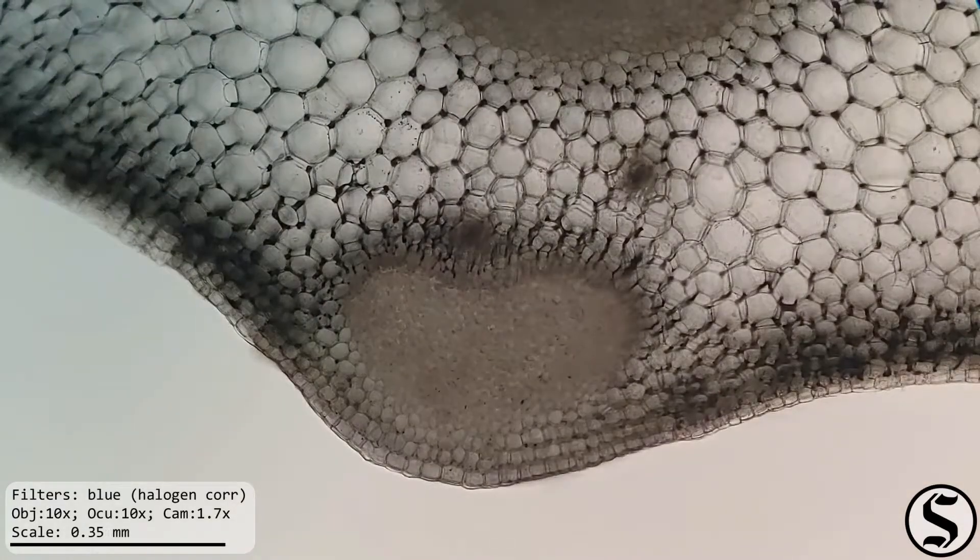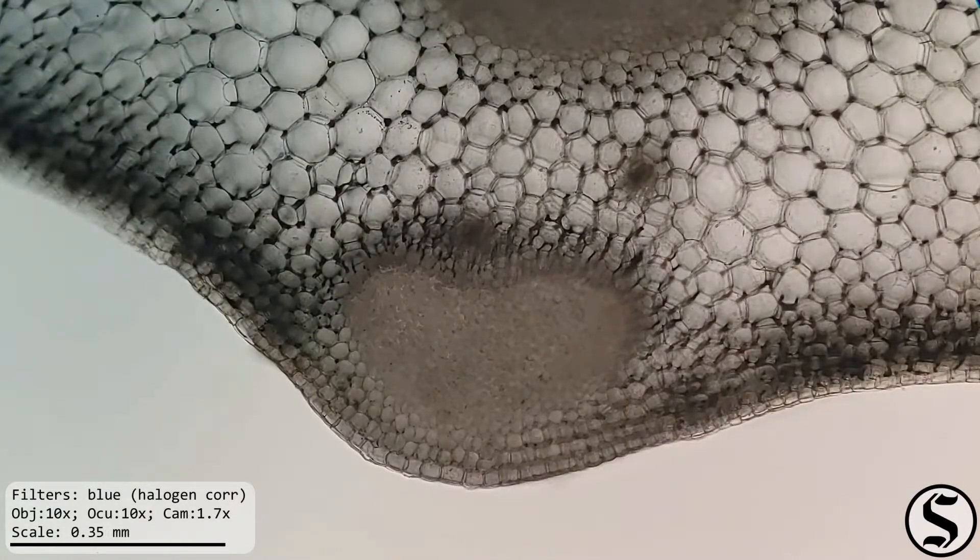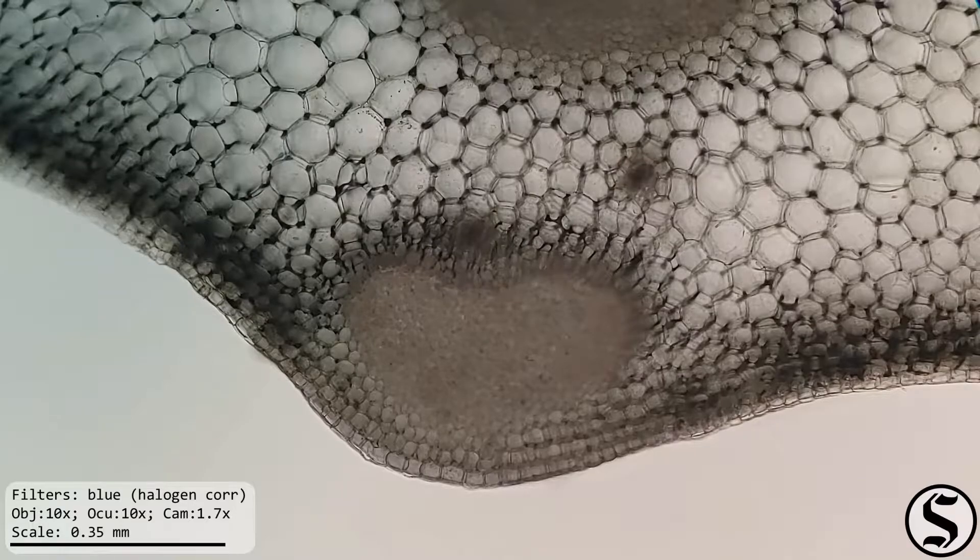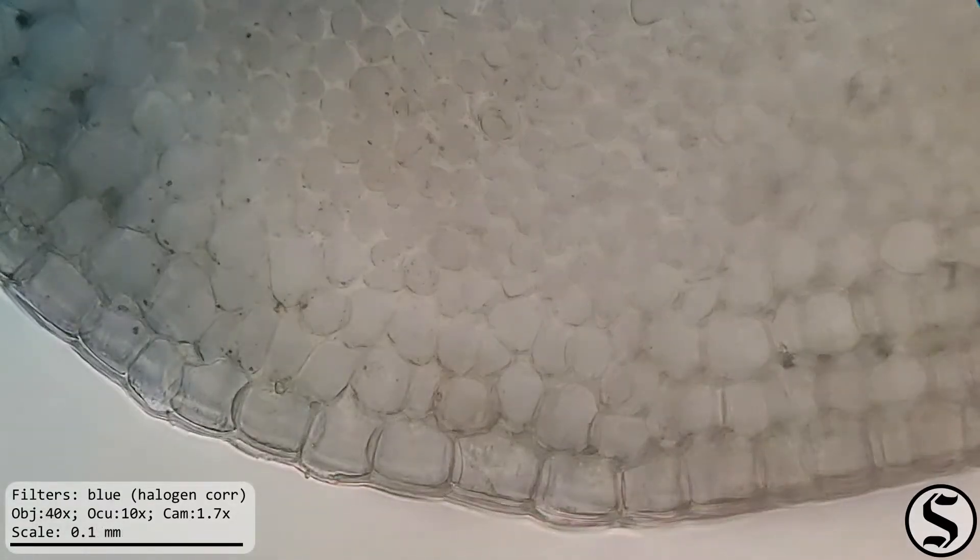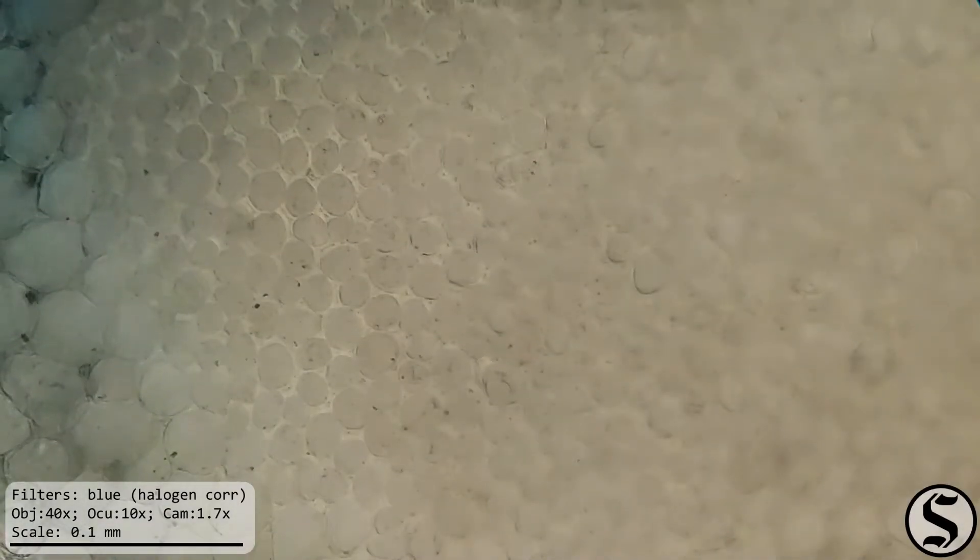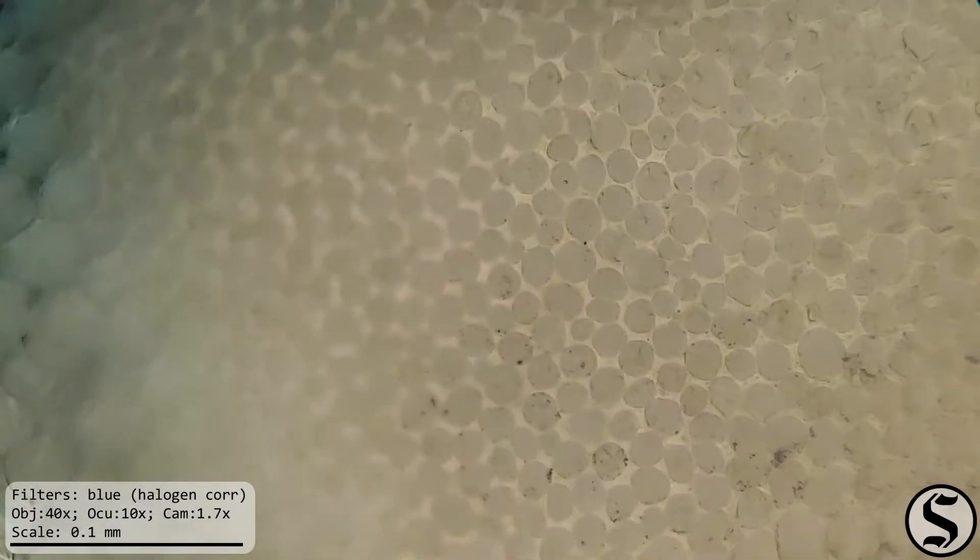And here's another one further along the outside. And we can see zoomed in on that that the cells in the collenchyma are of a distinctly different morphology from their surroundings which I think is really interesting.